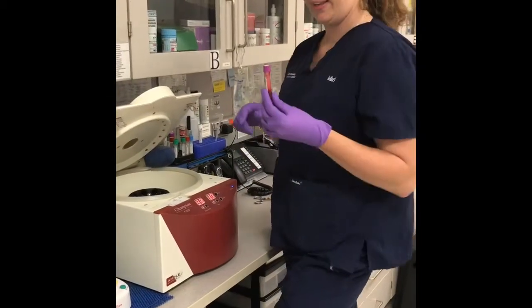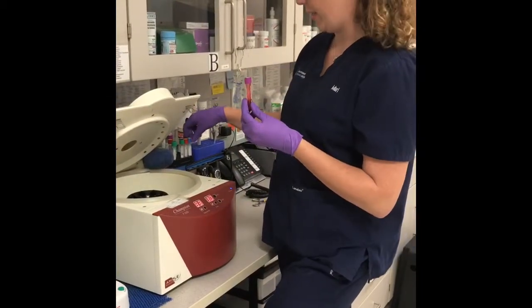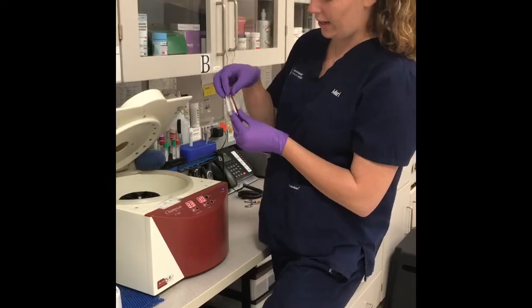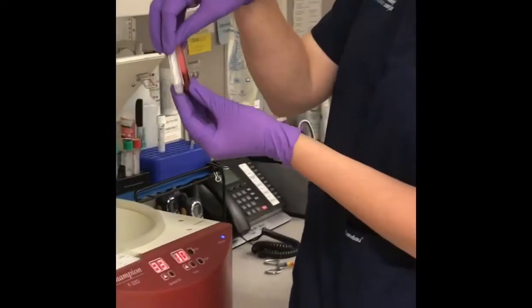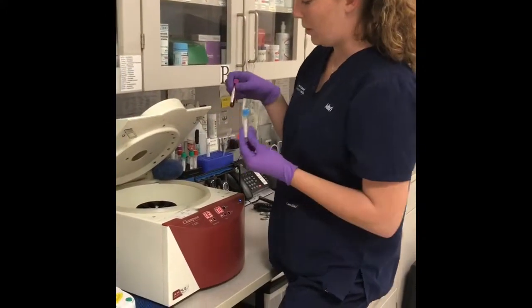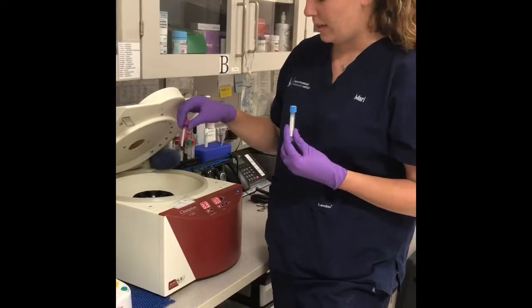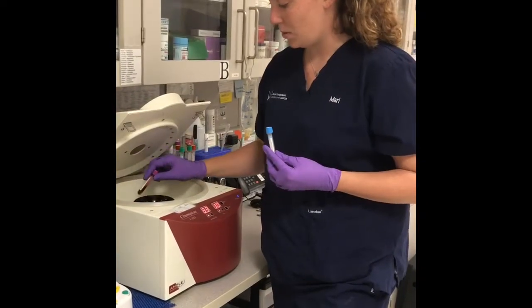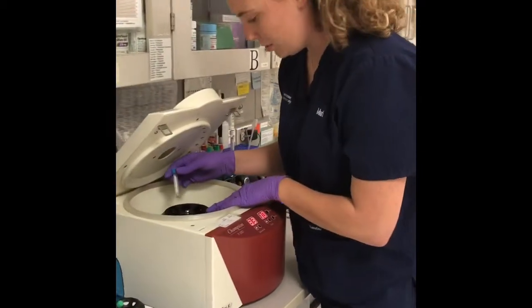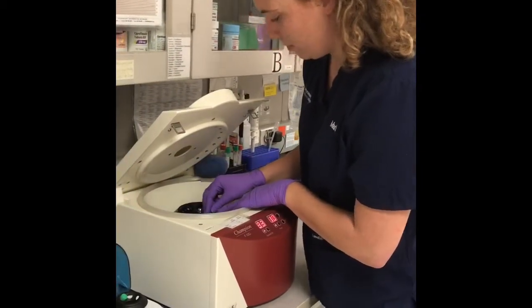Alright, so we're going to go ahead and prepare our plasma to be harvested. So I've got my lavender EDTA anticoagulant sample here. I've gone ahead and pre-selected a balancing tube for the centrifuge. So I'm going to go ahead and place both tubes within the centrifuge. I'm going to put my lavender tube in number 8, and then my balancer tube directly across from it, which is going to be number 4.